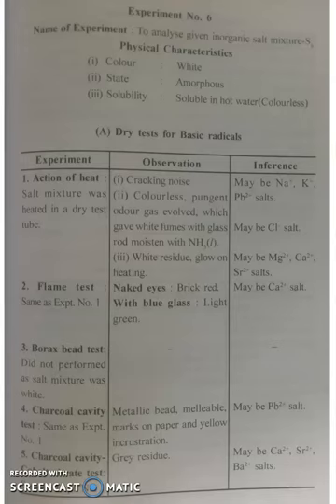So what do you need to do? You need to do first physical characteristics. Then you need to do dry test for basic radicals. Then dry tests for acid radicals.